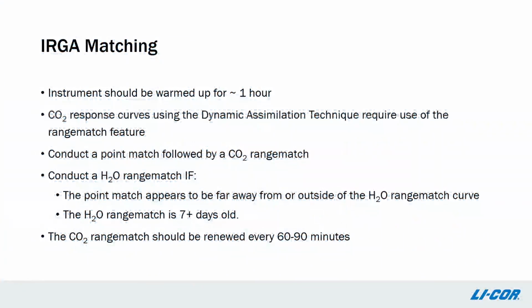After the instrument has been on and warmed up for an hour or more, the LI-6800 infrared gas analyzers should be matched. First, we recommend that users conduct a standard point match for CO2 and water vapor. Next, a full 5-minute CO2 range match should be conducted.